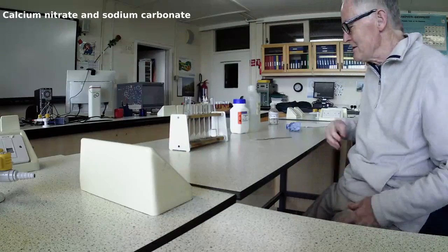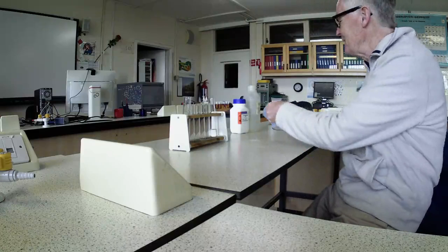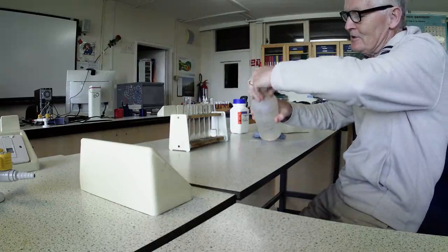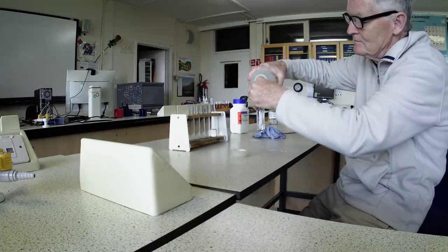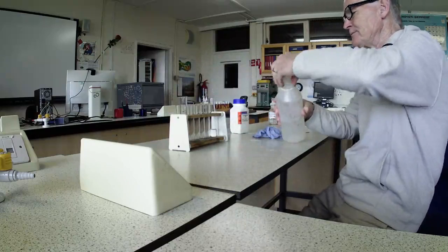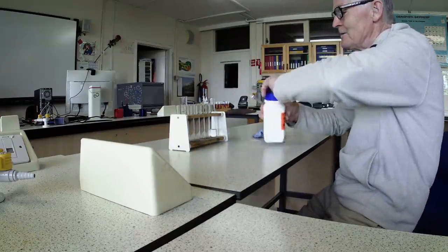Okay, my second experiment is to react calcium nitrate with sodium carbonate. Sodium carbonate I've already got made up as a solution. So we'll put some sodium carbonate in here. And the calcium nitrate, we shall make up the calcium nitrate.